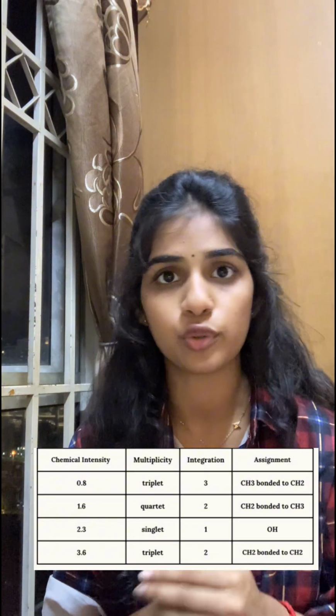Moving on, the signal at 2.3 ppm shows a singlet, with no splitting, which indicates no neighboring protons. The integration of 1 suggests that this could be an OH group. In addition, the signal at 3.6 ppm, with a higher chemical shift, indicates a CH2 group near an electronegative atom. The triplet pattern reveals coupling with 2 neighboring CH2 protons, and the integration of 2 fits this environment.